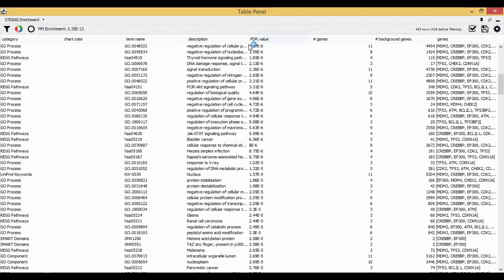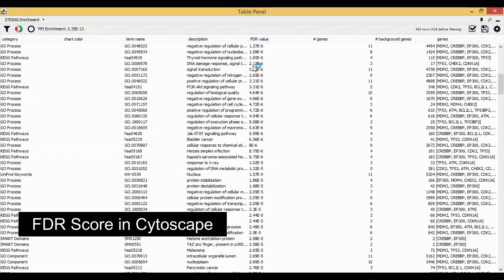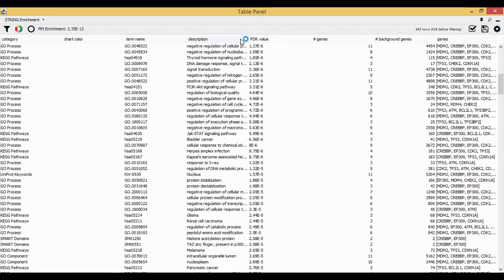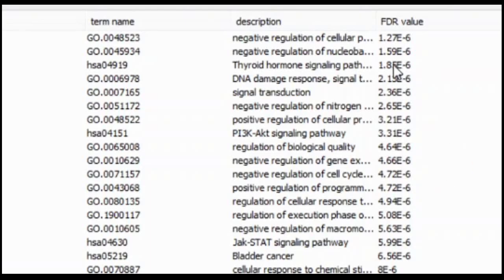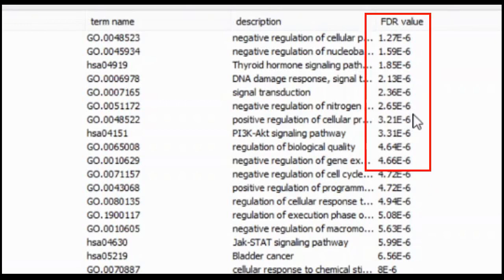As you can see here, there is something called an FDR value. FDR stands for false discovery rate. Ideally, the false discovery rate, if it is less than 0.05, is always considered good.